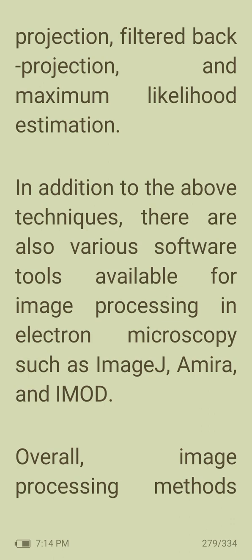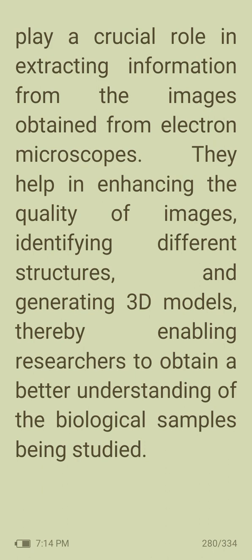Overall, image processing methods play a crucial role in extracting information from the images obtained from electron microscopes. This helps in enhancing the quality of images, identifying different structures, and generating 3D models, thereby enabling researchers to obtain a better understanding of the biological samples being studied.